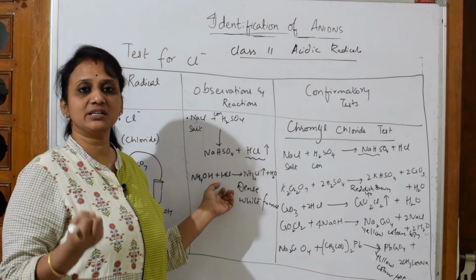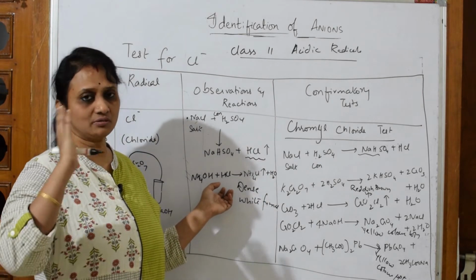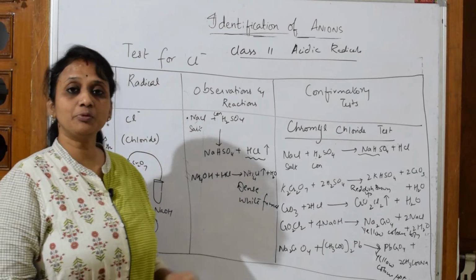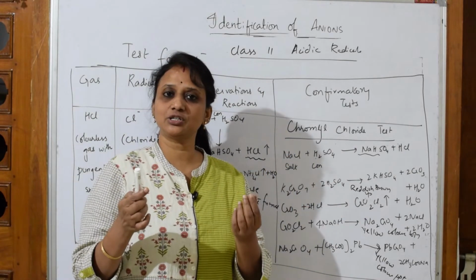I started observing dense white fumes, so the chloride observation is about 50% done. Now I am going to perform the chromyl chloride test. I will be taking 2 test tubes.